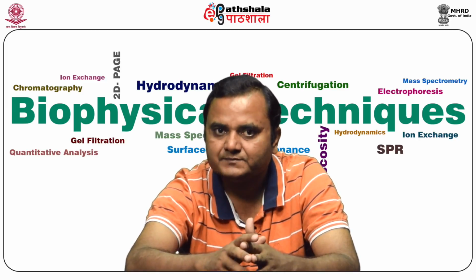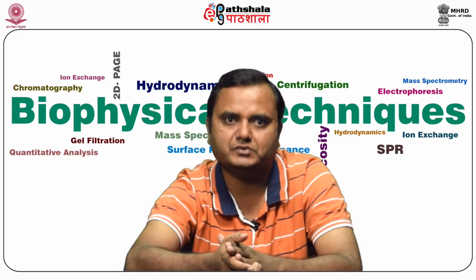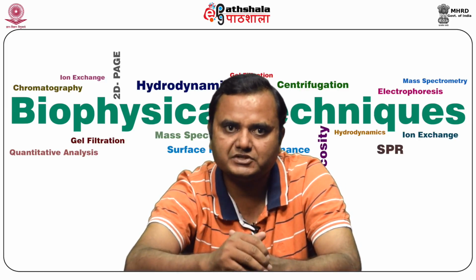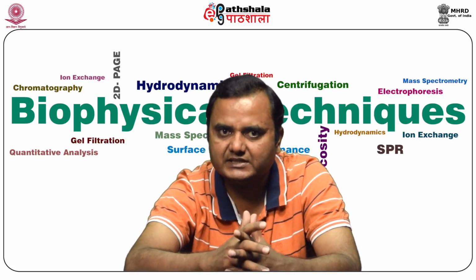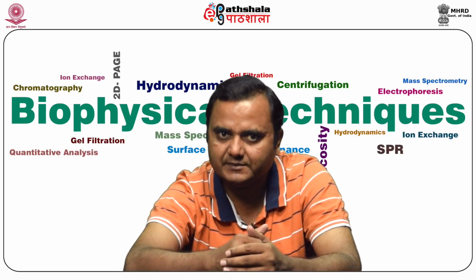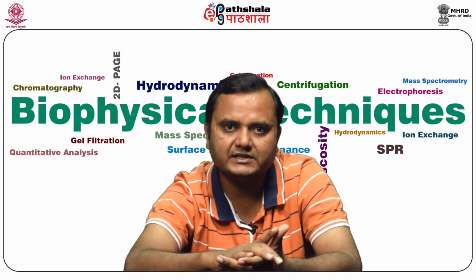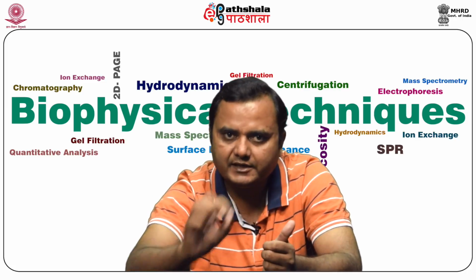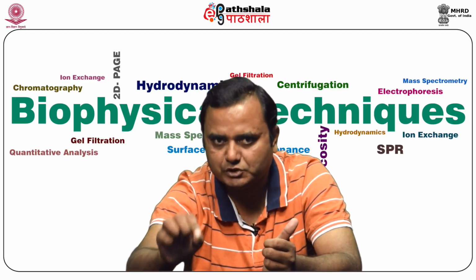Density gradient centrifugation is further classified into two groups: rate zonal centrifugation and isopycnic centrifugation. Both types depend on the density gradient, but they have some minor differences. In rate zonal centrifugation, the sample is centrifuged until the most dense component approaches the bottom of the centrifuge tube.